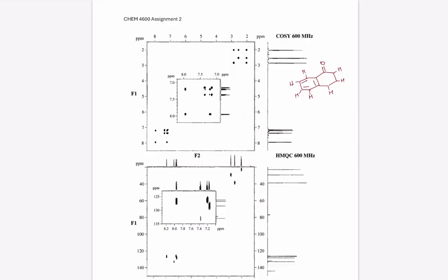Okay. The first thing that I'm going to do here is letter the peaks that are present in the HNMR going from downfield to upfield region: A, B, C, D, E, F, G. And then I will also mark this expanded version right here. So that's going to be this region right here, which is my A, B, C, D.